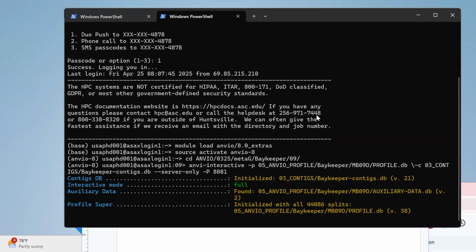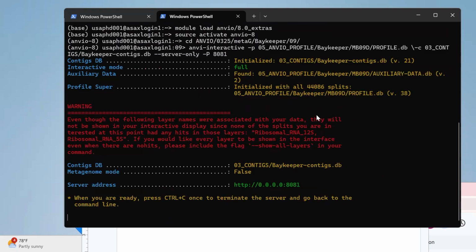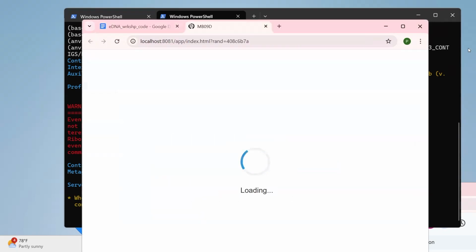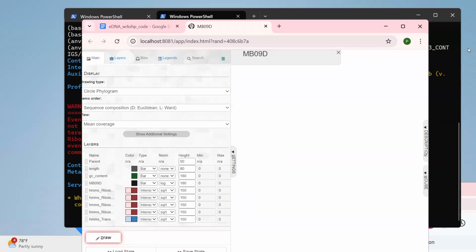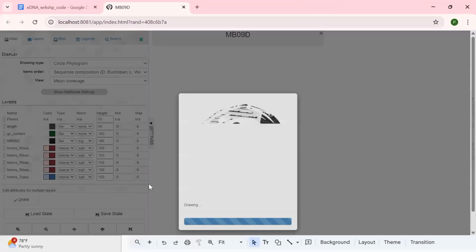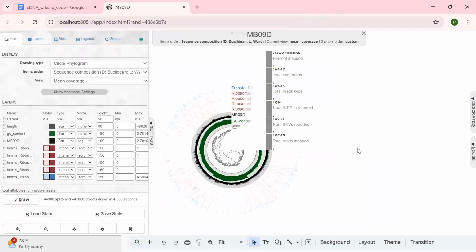If you were doing this on your standard laptop, not the supercomputer, how long would it take to go through this roughly? It was so short, it depends on the number of samples that you're working with. If you're just working with those samples, it's just that quick. If you're working with a large number, a few hundred samples, that's a different story. So it's not time, it's more memory storage.